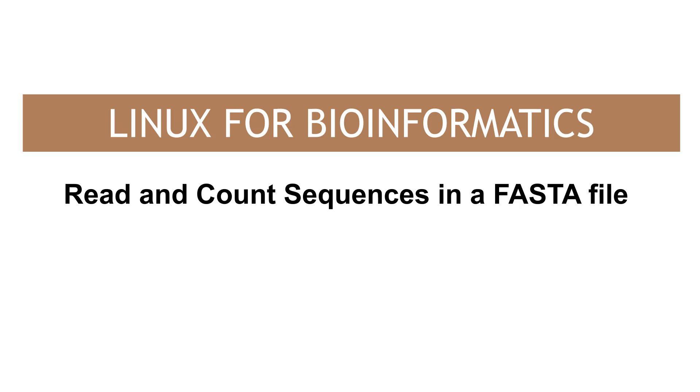Hi everyone, welcome to the series on Linux for Bioinformatics. In today's video, I'm going to show you how you can count the number of sequences in a FASTA file.